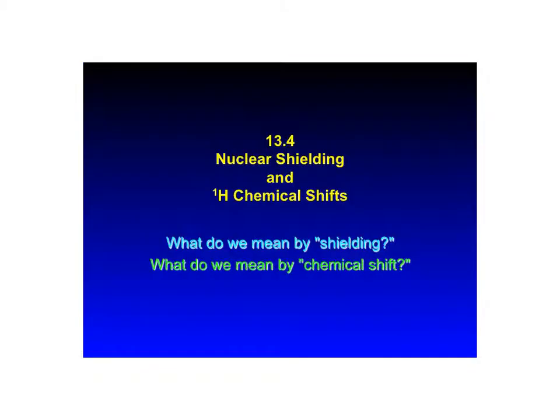All right. So now this comes to what's hugely, hugely important. There are two terms that get used a lot, and that's shielding and chemical shift. Okay?